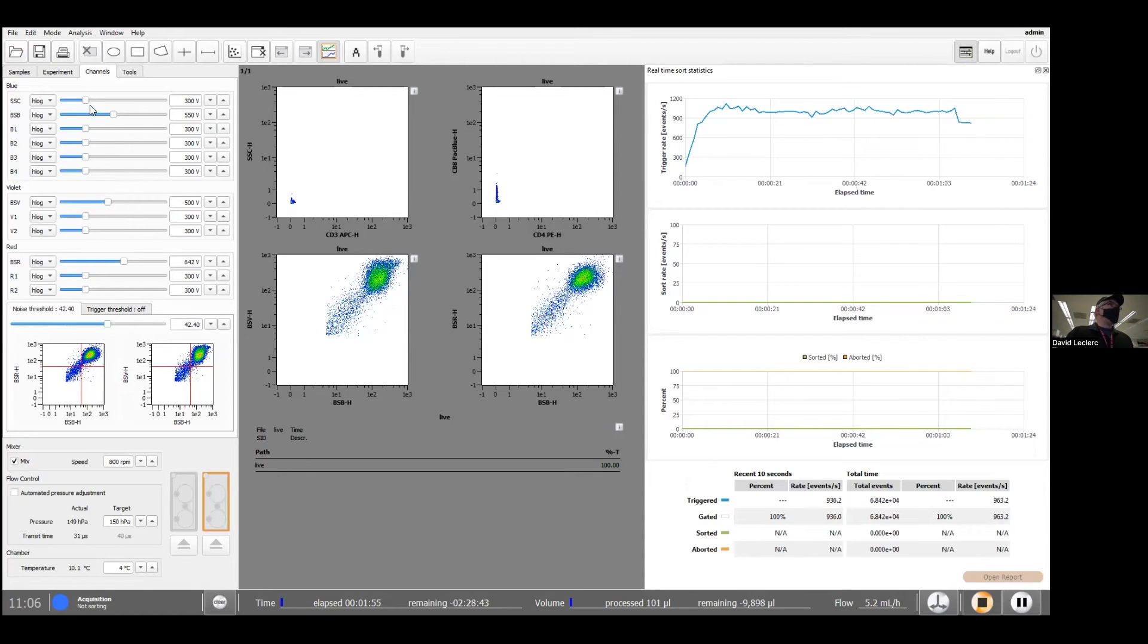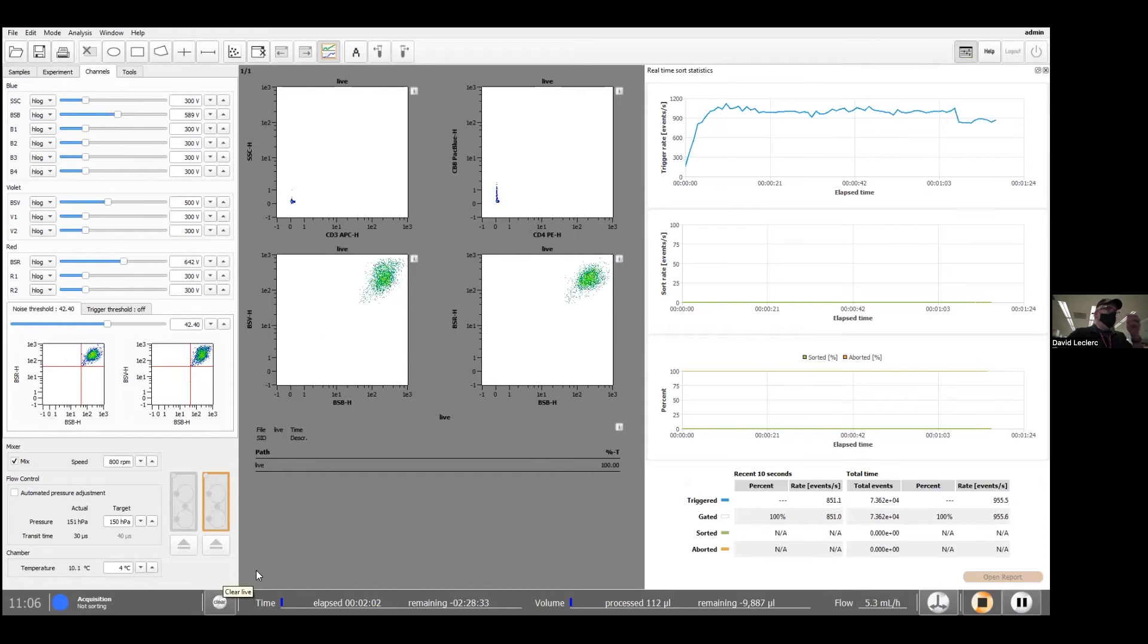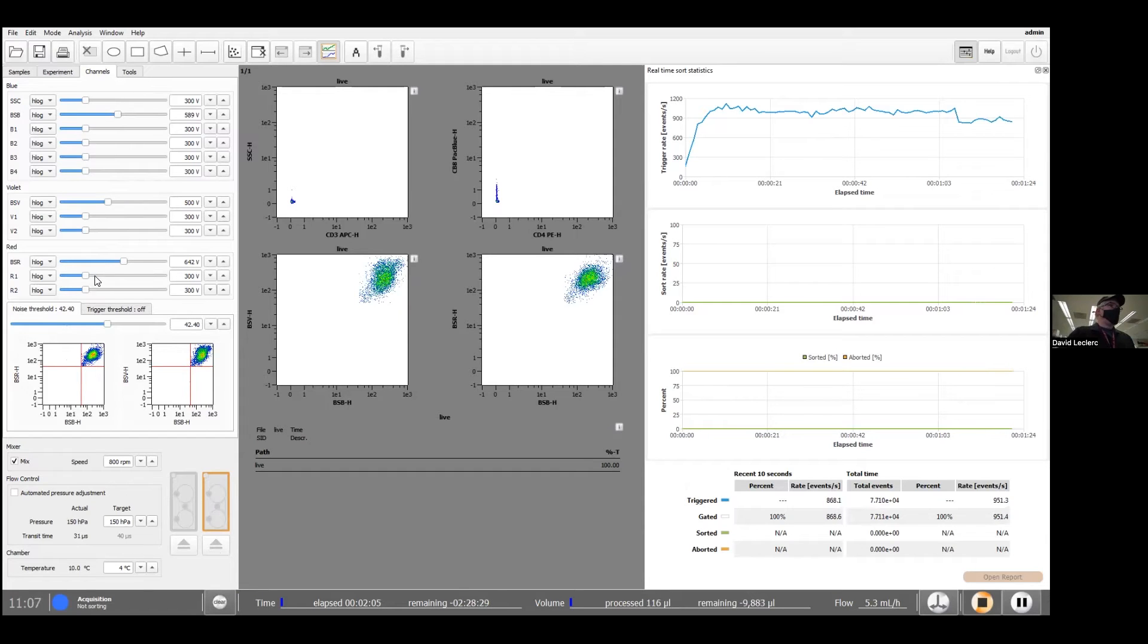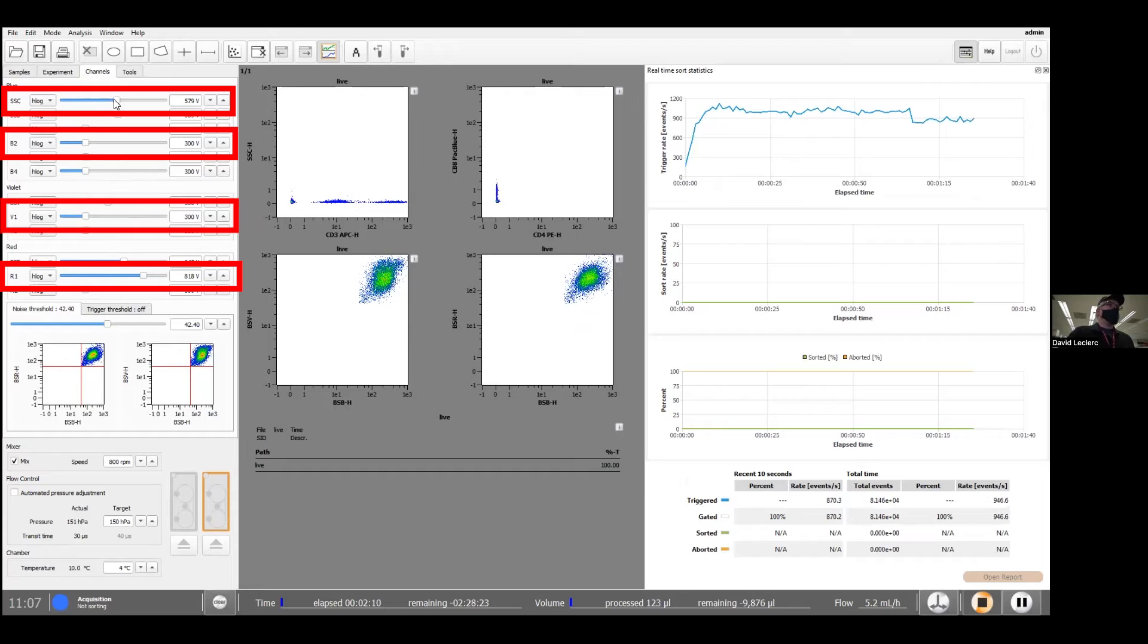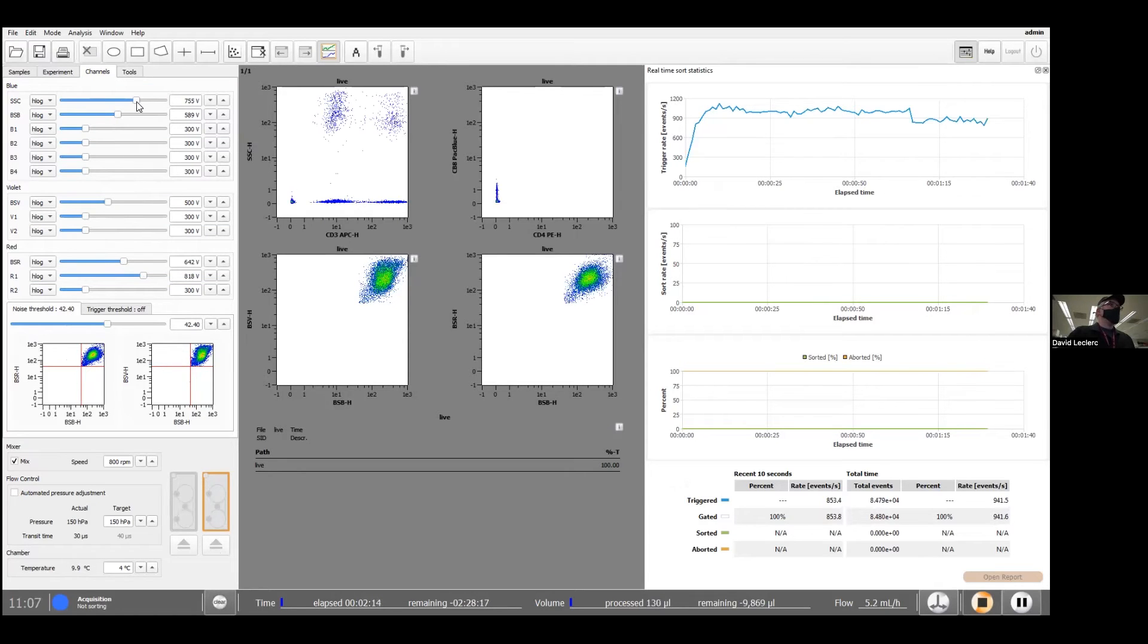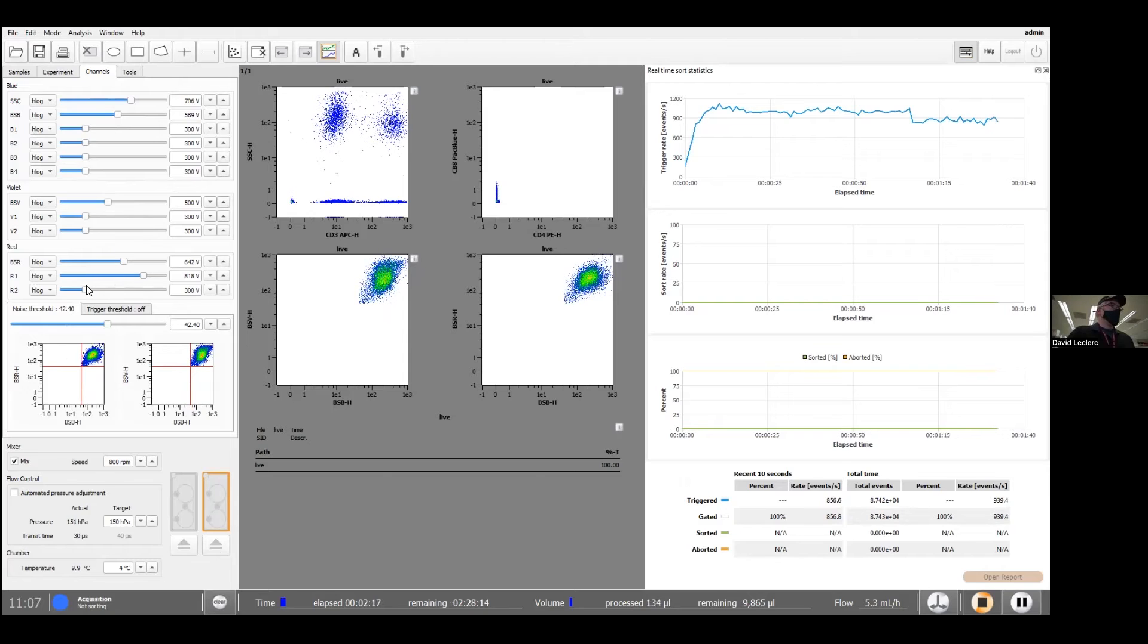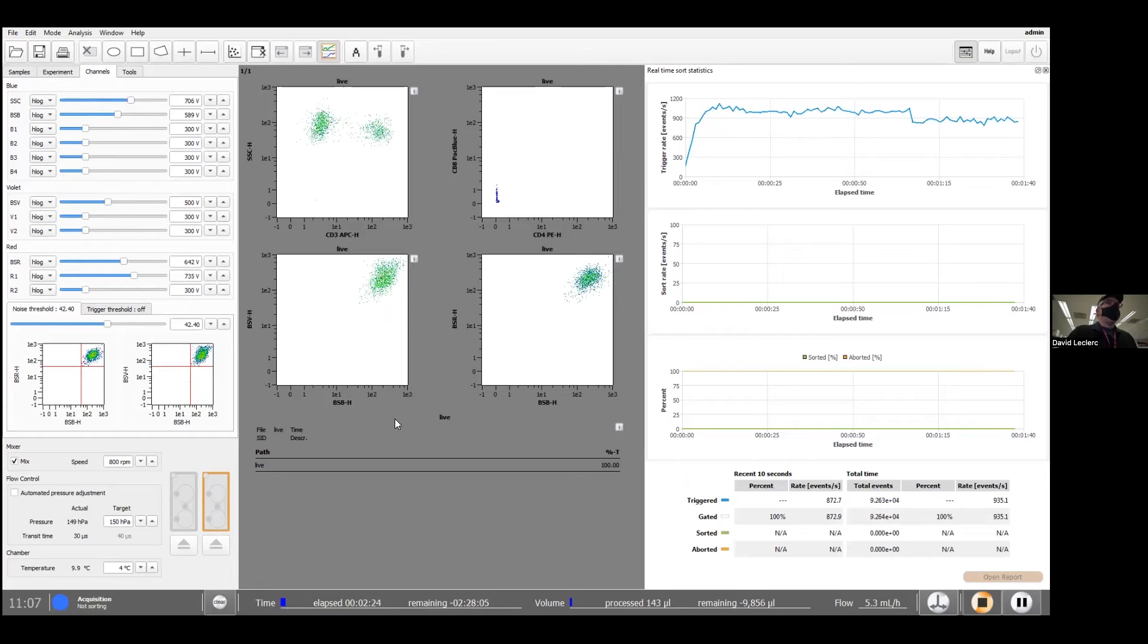Just for fun, I'm going to increase my blue side scatter. That looks really good. Now we can go ahead and set the voltage for the rest of these detectors. So we have APC first and my side scatter as well. Let's have a good separation. We'll set the gate.